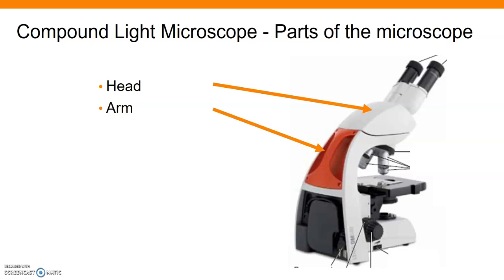I will say that handle is plastic, so I will encourage you to use two hands while carrying your microscope. The base, which is the bottom part of the microscope, is then going to have a place for your other hand. You hold the arm with one hand with the handle and put your other hand under the base so you're fully supporting these microscopes while you carry them. They're not the heaviest microscopes I've ever used, but they definitely need some support.